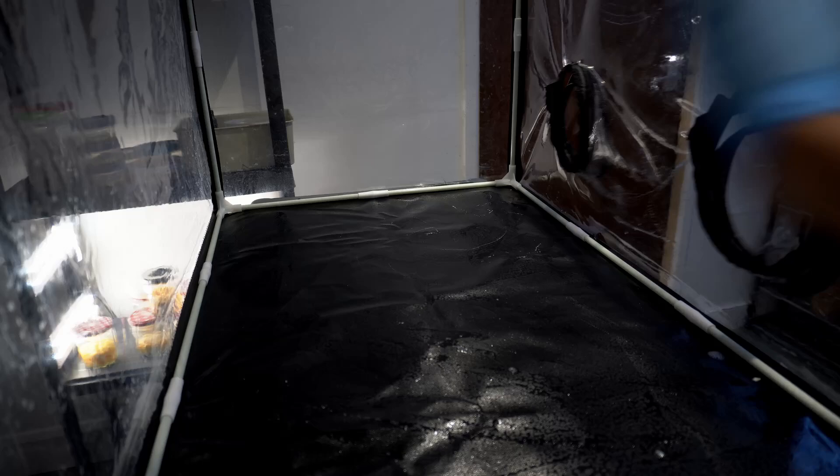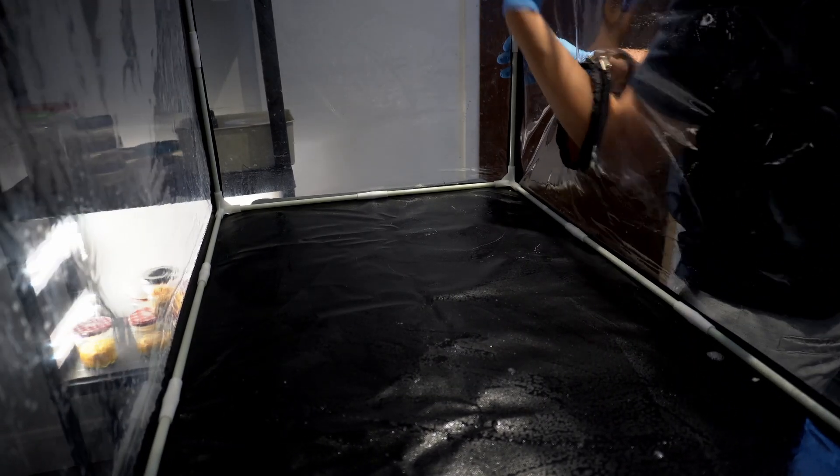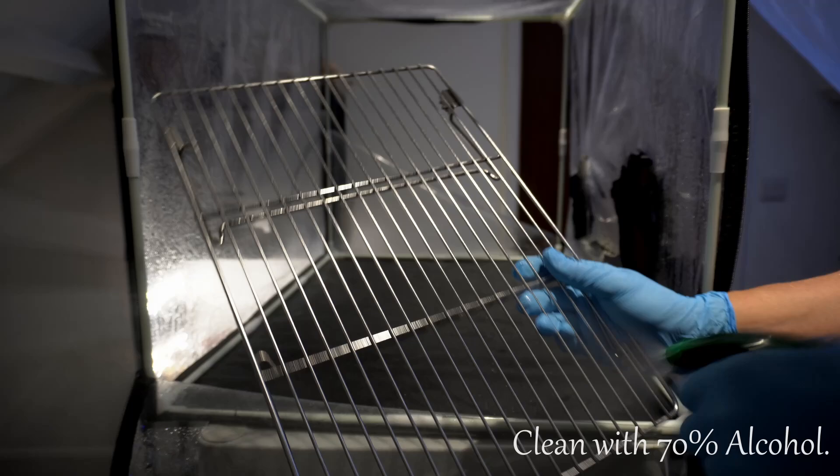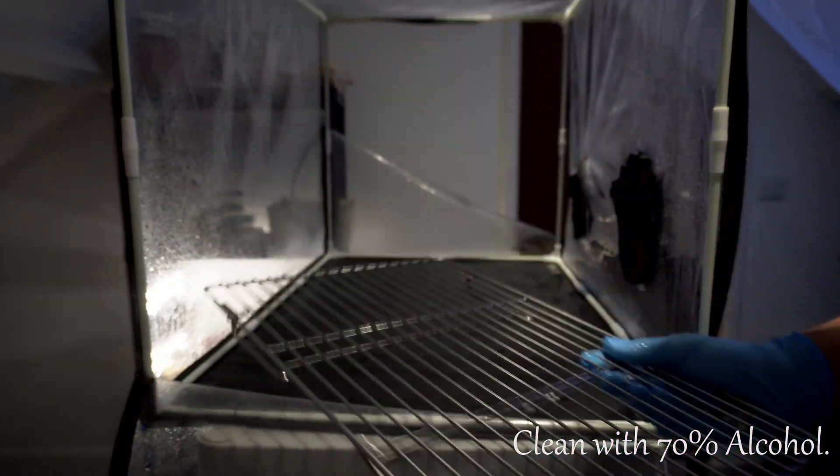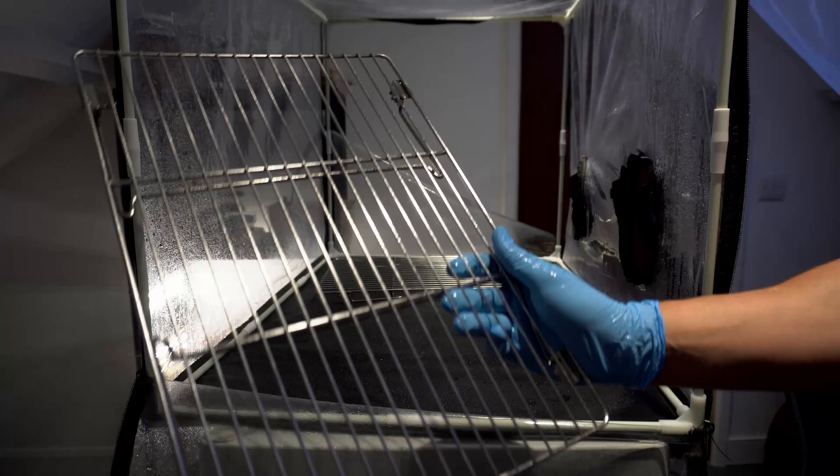First we're going to prepare the still air box by wiping it down with soapy water. Next wipe down all utensils and jars with 70% alcohol solution and then seal the still air box.